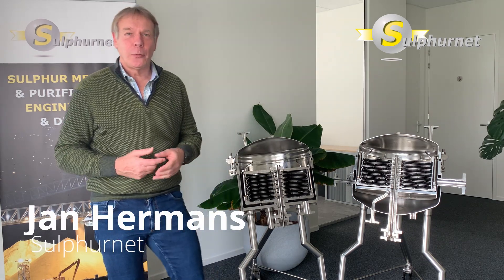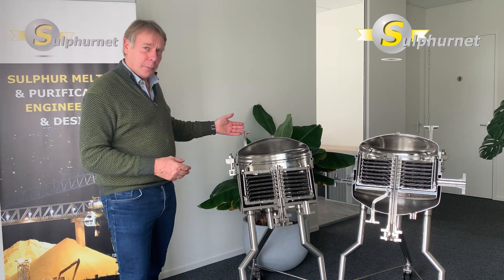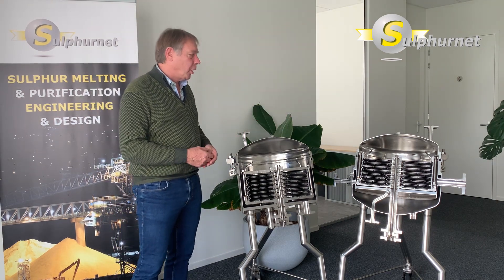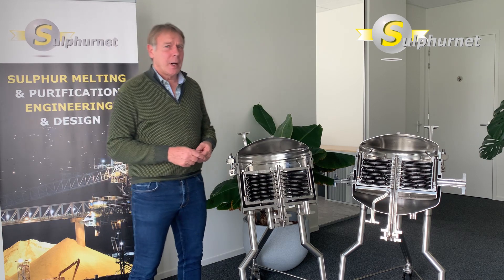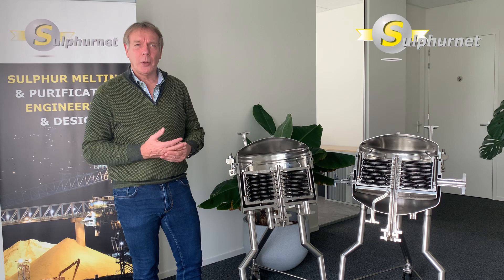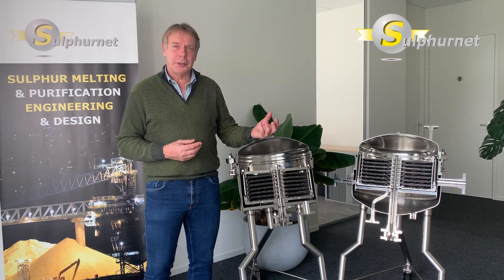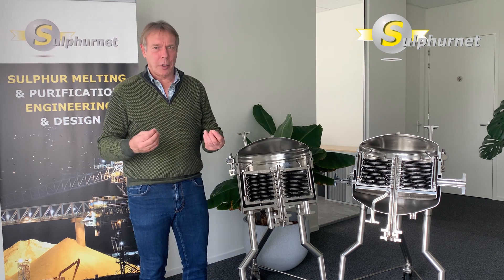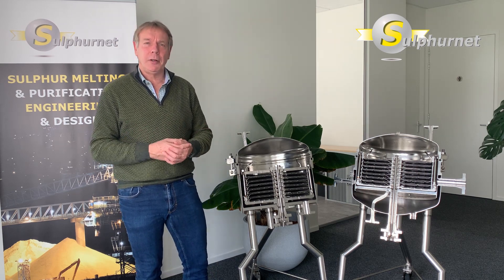Welcome to the Sulphurnet workshop series. Today we want to present our horizontal plate filters. We have two display units of the horizontal plate filters. They have been on the market for many years and are used in various applications, including pharmaceutical applications, resin filtration, and filtration of varnishes and other sticky products which have difficulties with self-cleaning filter systems.